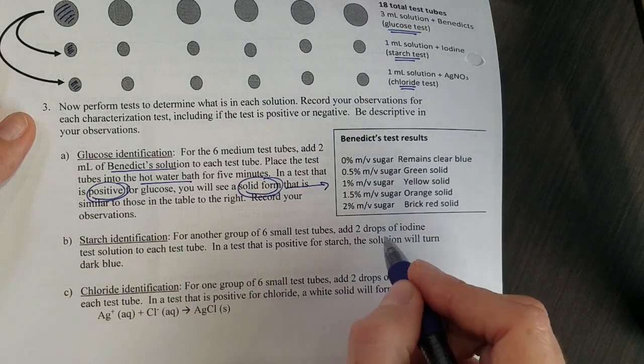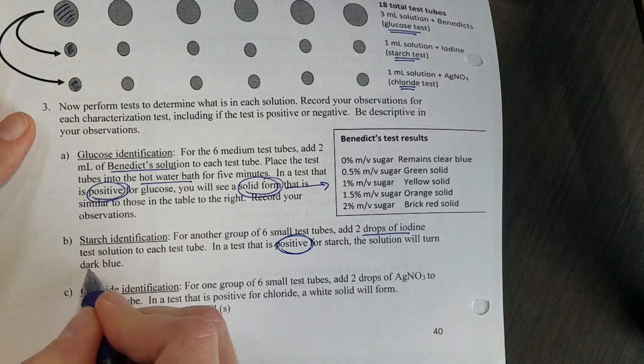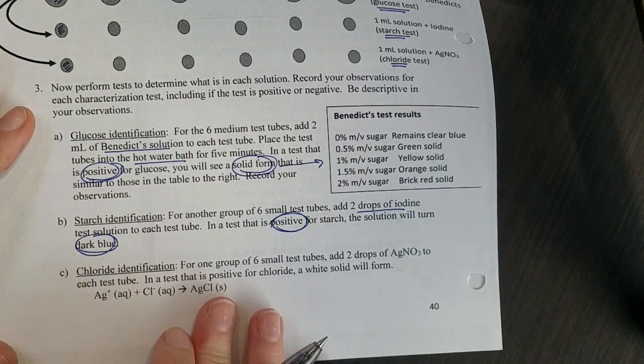Starch will be very simple. We're going to add iodine. If the test is positive the solution is going to turn dark blue, otherwise there's no starch present.